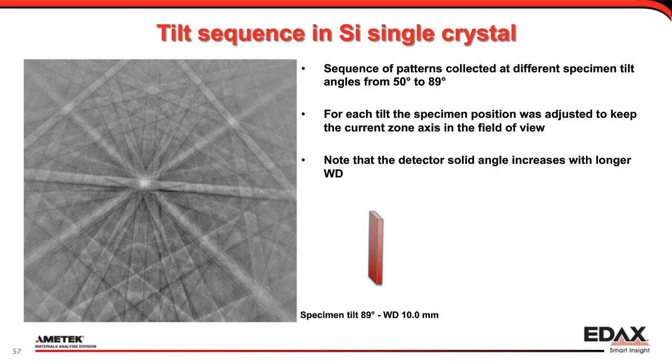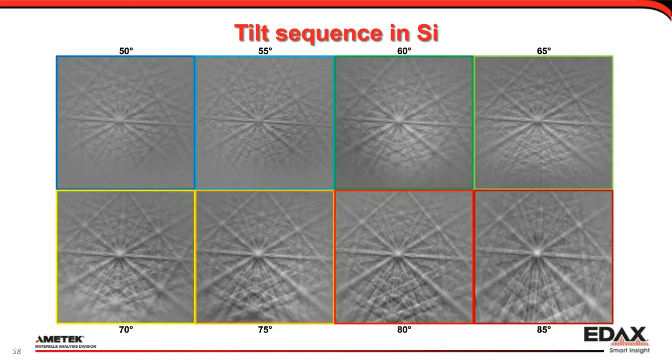And that indicates, again, the amount of material interaction of the electrons. So you have just these patterns next to each other, where you can see the increase in band contrast, and towards the right, there's 85. It starts to flatten, then 89 I don't have on here, but then we could just see that the bands got very sharp and with very little internal contrast.